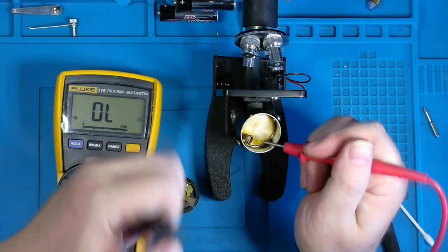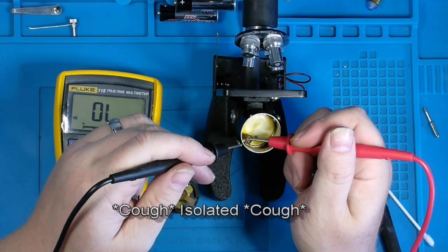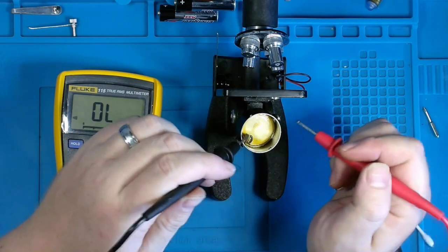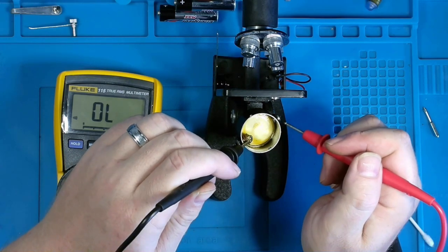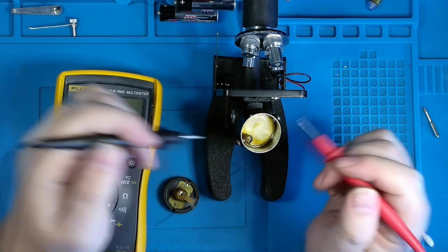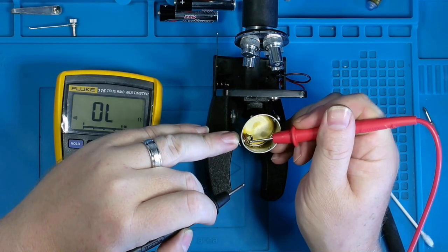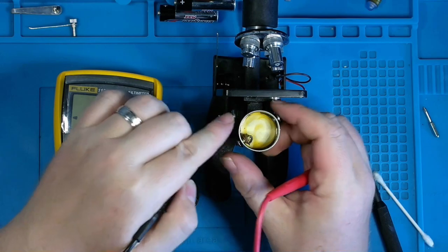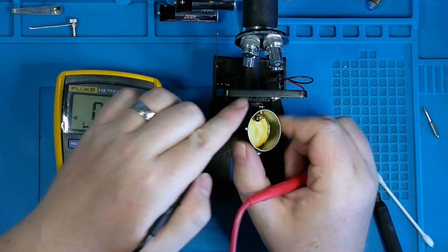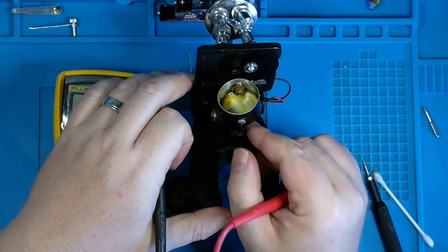And that's because the same type of grommet that would have insulated our negative terminal from the positive terminal has also worn out inside of here, as you'll see when I touch these two posts together. Essentially, the negative terminal comes in and then it is soldered to this point right here. Let's see if I can turn it a bit for you to see better. We can put it up like that and you can see it better.